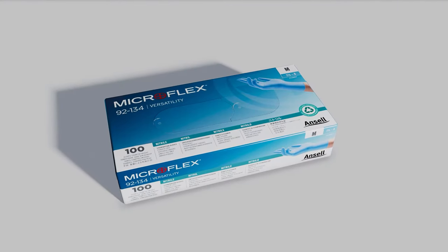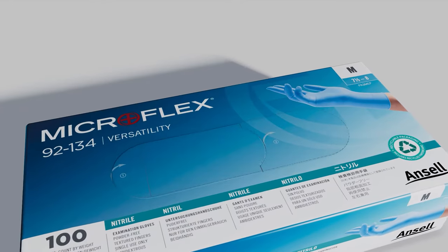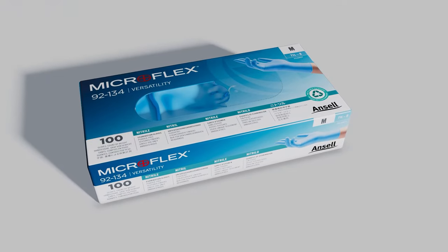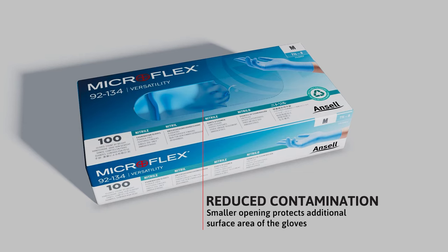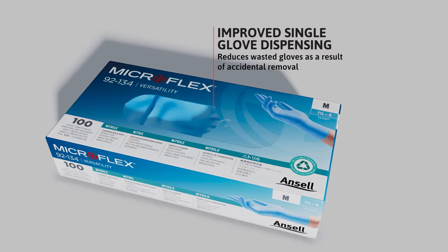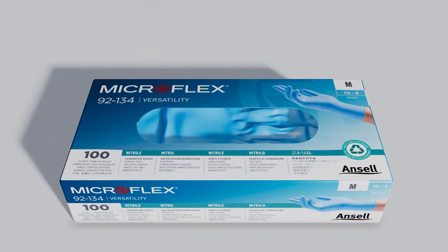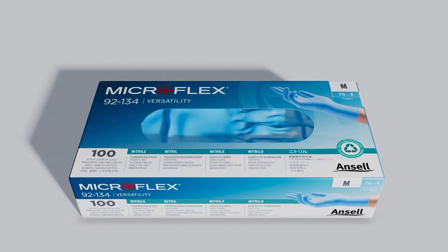In addition to these design updates, the new MicroFlex packaging will feature three key enhancements. The new perforated opening tears away in two steps. By tearing away the left side, gloves can be dispensed through a smaller opening, which is designed to protect the surface area of the gloves from contamination and makes it easier to remove one glove at a time, reducing wasted gloves as a result of accidental removal. As the content of the box is depleted, the right side of the opening can be torn away to create room to reach deeper inside.